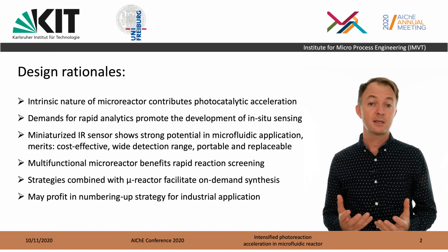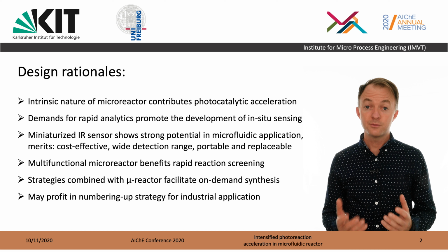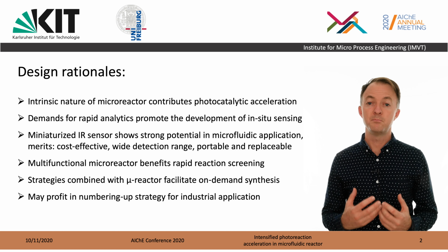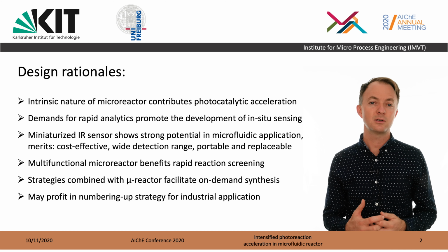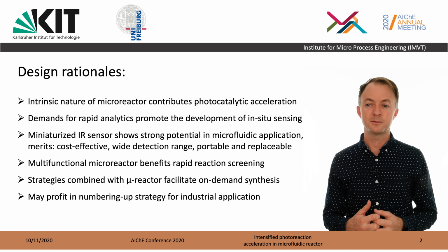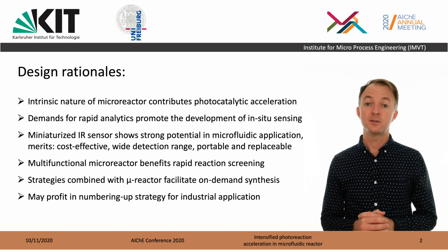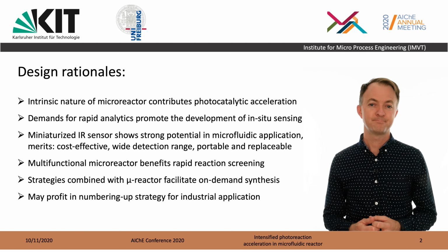The benefit of having that is that we could have a multifunctional reactor that can possibly be used for different reactions within the same reactor, and eventually this should help us develop strategies or build methods that we can use to design multifunctional reactors that could be used to synthesize chemicals on demand, where we basically dial a molecule. That would be the ultimate. And one of the known benefits of microfluidic reactors is that they can easily be scaled up through a numbering up approach.